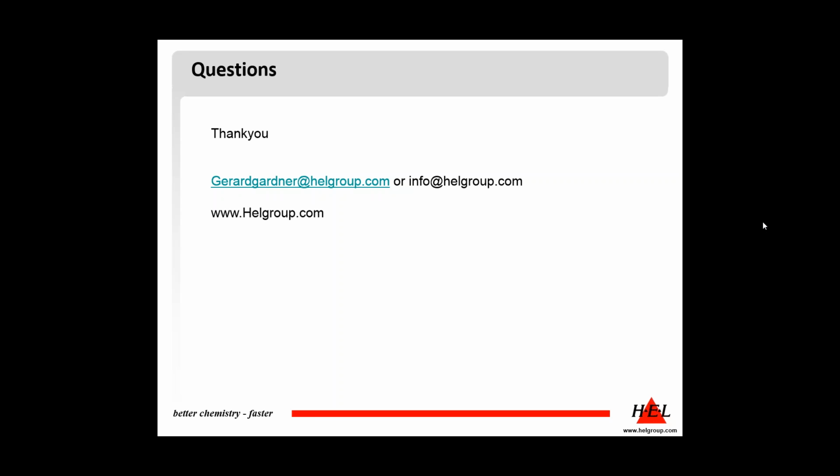How are the reactors sampled during a fermentation? We have different strategies depending on the standard systems. We have two possibilities. We have either a reinforced septum, where we use a high pressure syringe for manual sampling, or more conveniently a T-junction which is linked to one of the flow controllers. This allows an aliquot sample to be taken, and then the dead volume within the tube is cleared with the gas from a flow controller, so that's rerouted into this sampling tube.